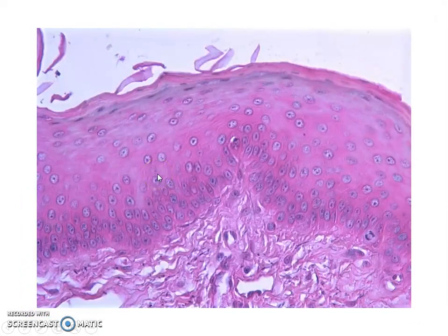And when we zoom in by looking at a cell at a higher magnification, you can see superficially these cells are pretty thin and plate-like. Now, interestingly, as we move deep, we're looking at the nuclei of these cells here and the cells around them, and these are a little bit thicker.